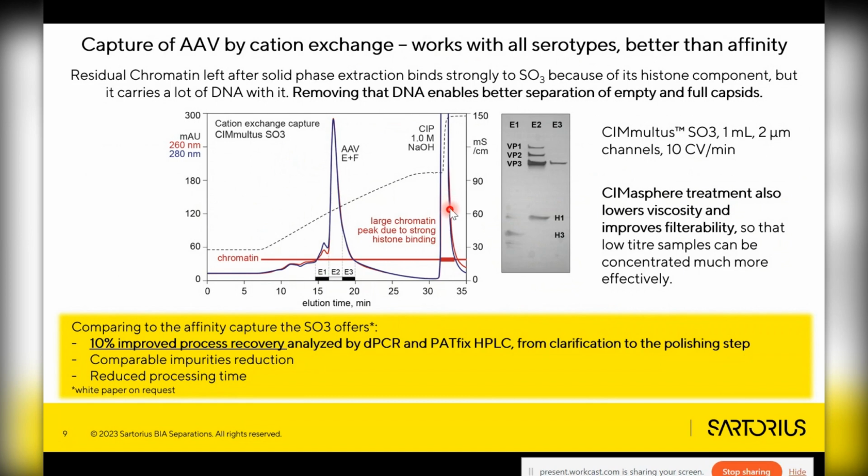So the column will relatively soon not be performing anymore. Maybe you can perform 10, 20 runs. Afterwards, probably you would not do a very long sodium hydroxide treatment, but you would probably change the column. Even in the AAV itself, if you go to the SDS-PAGE, you'll still see some residual histone bands, which means although there are 2 quite powerful chromatin removal steps, there are still some residual chromatins left.